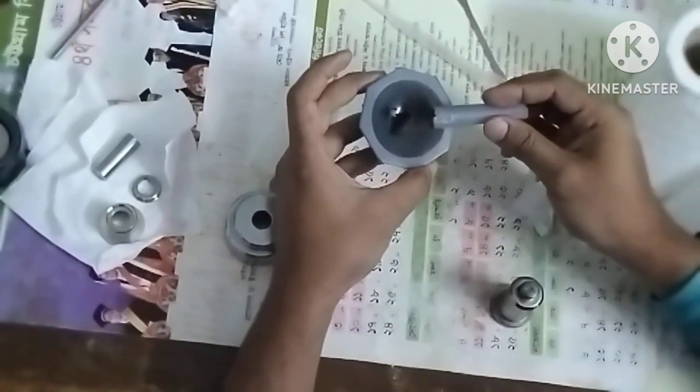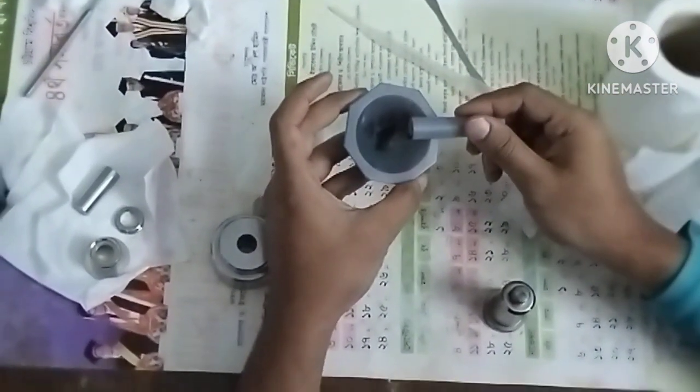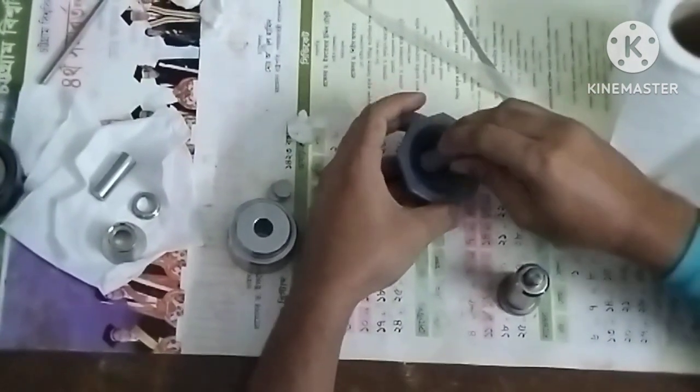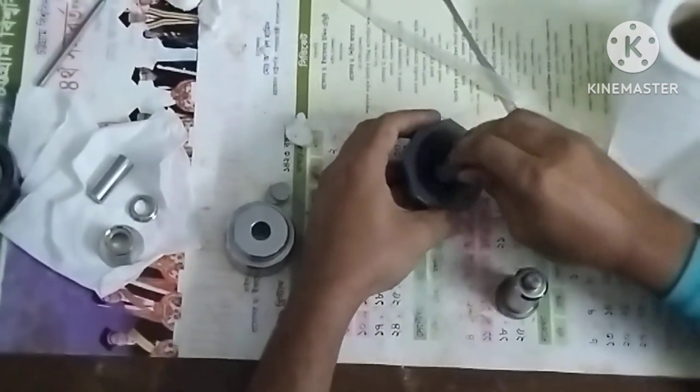Then we are taking this: in the left hand it's a mortar and in the right hand it's the pestle, and we will keep KBr and at the same time a small amount of sample.